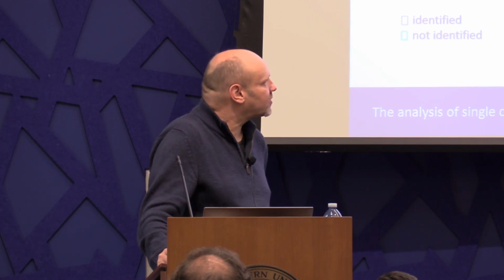Sorry, I had a comment about that question also, because that's something that I've been finding: the way most software handles the TMT data at the PSM level, they kind of average, right? Across all PSMs they get for a particular peptide, and that's how they calculate the protein abundance. That will be the next slide, how we do it actually. Yeah, but what I found is that if you take the PSM for which you have the maximum intensity, then you get much better quality TMT signal and much more accurate ratios. That's a very good point, and that will actually come on the next slide.